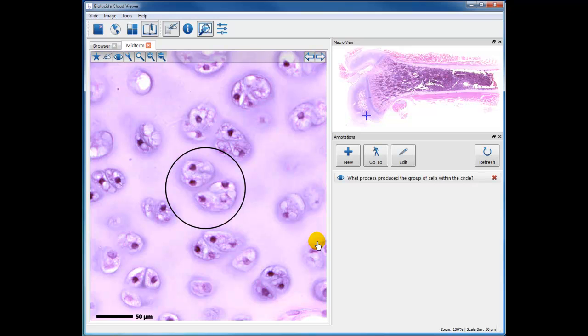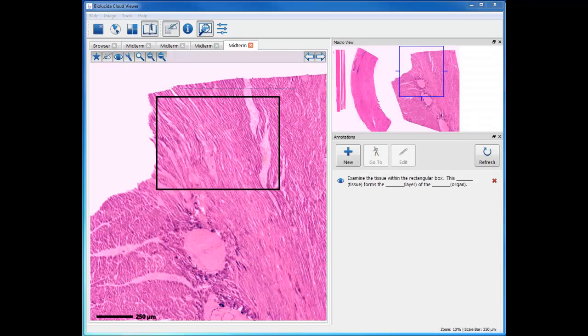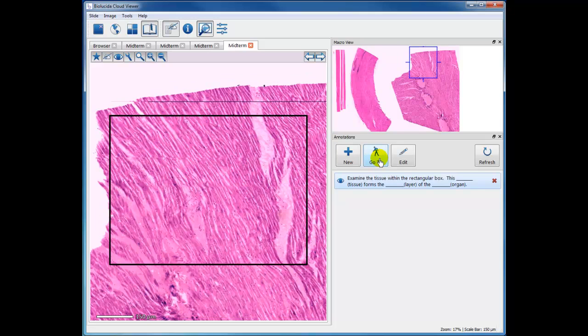You need to not just make a snap identification or a snap response, but think, because that's why we give these unknown specimens in the part B of the quizzes as well as the midterm. So now I'm going to pause this and go to one more example. Okay, here's another question. First, I'm going to make sure that it's oriented the way we put it.